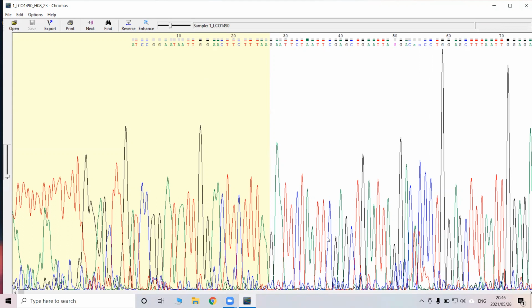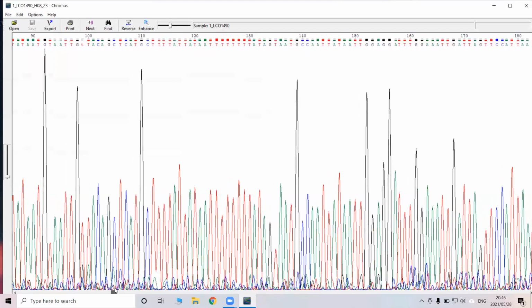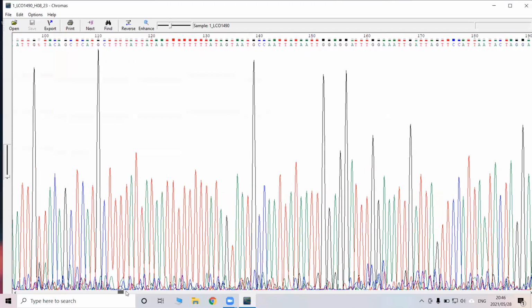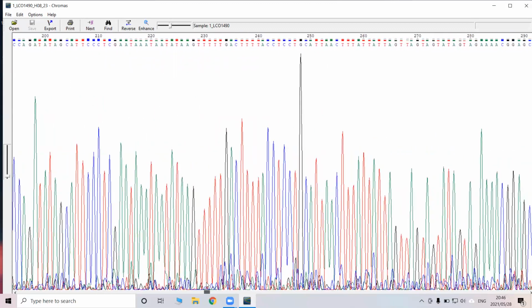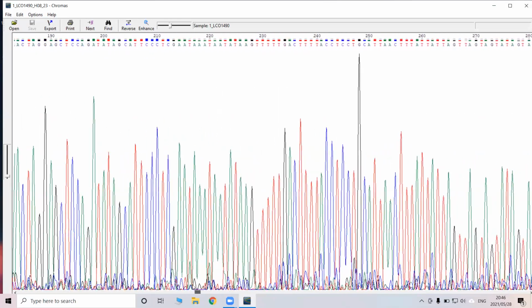Now, since this is being used to assign nucleotide positions in a PCR product that was sequenced, there will be regions of noise, which should be expected, and there will also be regions where we get very good, clear, distinct reads. These are regions that we ideally want because the assignment of nucleotides is the most accurate within these regions.